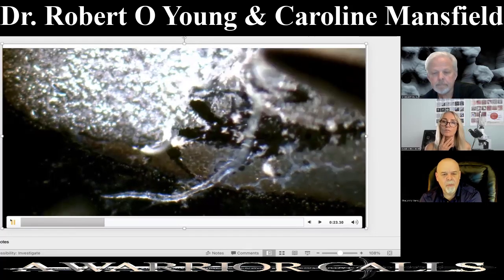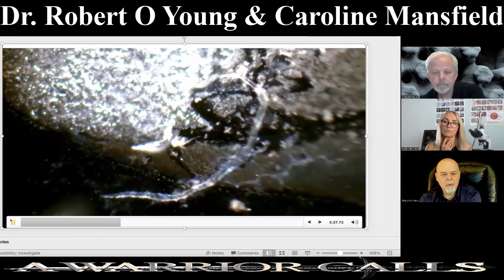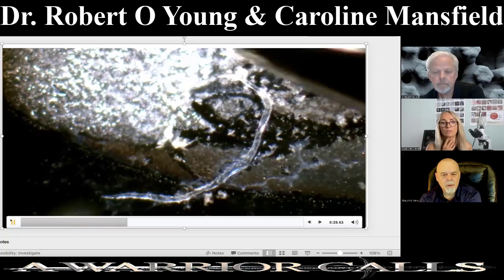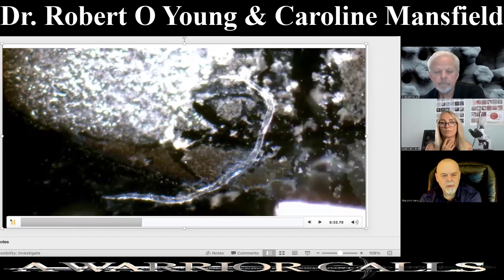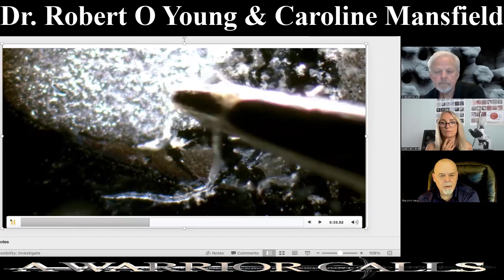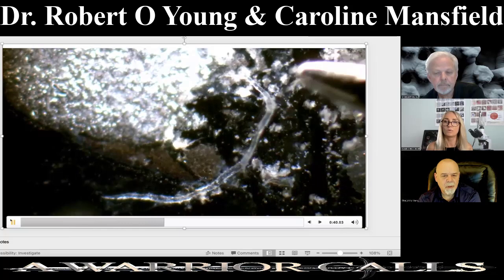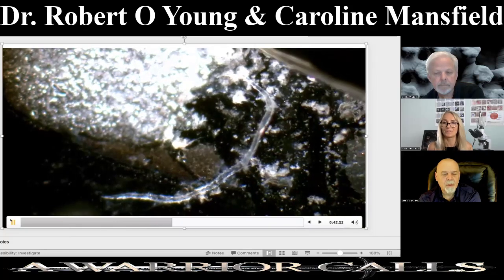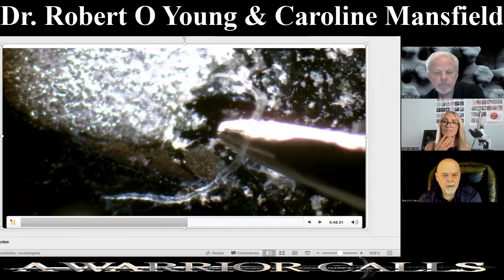This hydrogel structure at the tip of the needle was able to be moved. Everything's done backwards to how your brain is working when you're doing things on the microscope. So I kept missing it, but you can see it's actually, it is something.